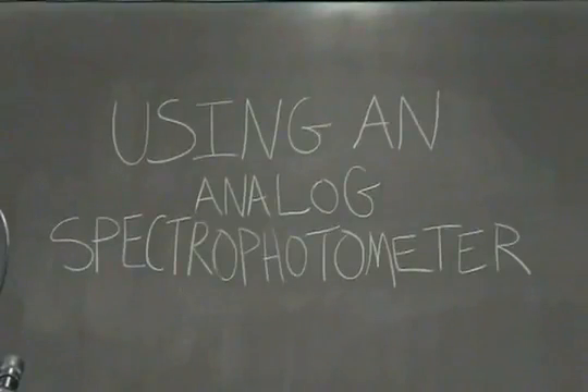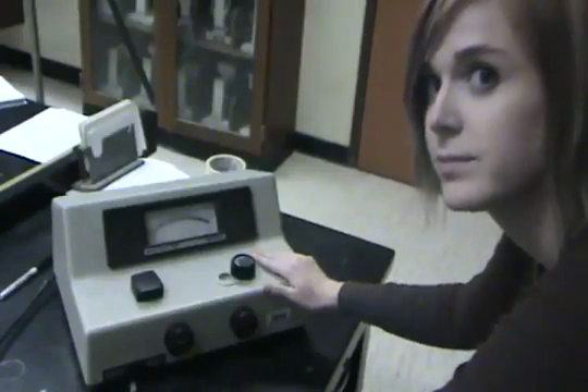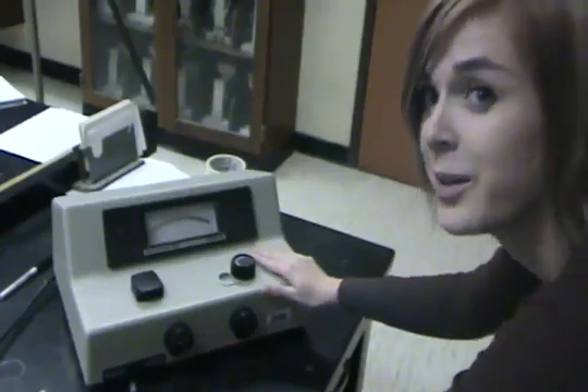Hello, this is a lesson on how to use a spectrophotometer. Here is our Spectronic Spectacular Spectrophotometer. Make sure that it has been plugged in for at least 15 minutes to warm up. The first thing we should do when we are using our spectrophotometer is adjust the wavelength to our desired wavelength.